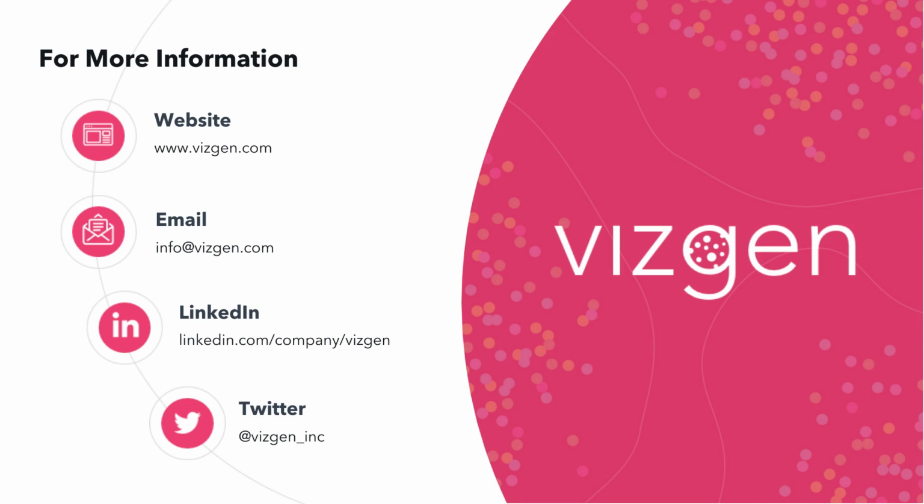Thank you. Next question. With the neuroblastoma tissues, we see high fluorescence. How do you take care of the autofluorescence? Yeah, I think this is a great question and really relates to the previous background question asked before. Indeed, in brain, lipofuscin and such is one of the major concerns and causes a lot of background. And the two steps mentioned, the autofluorescence quenching and clearing, in general, can help remove the background. If you're interested in seeing how this performs, you can go to our website and download our tech note. We do have a section on how to address the autofluorescence background. Thank you.